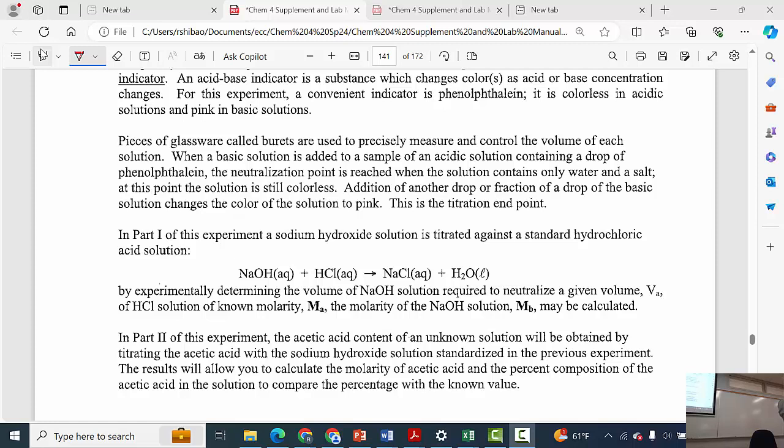We're trying to push a ball down the swimming pool or deeper into the water. But if I tilt this horizontally, this is just like trying to push a ball horizontally underwater, which is going to be a lot easier. And so I'm going to just shake this a little bit, make sure there are no air bubbles left. Okay, and that looks good.